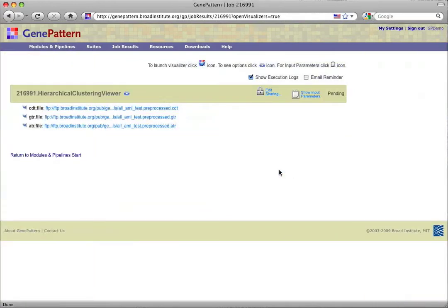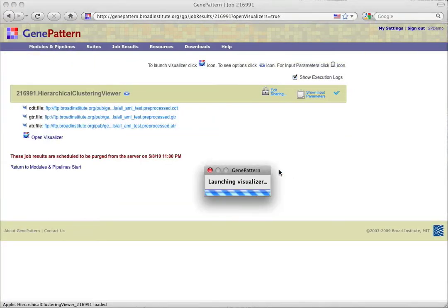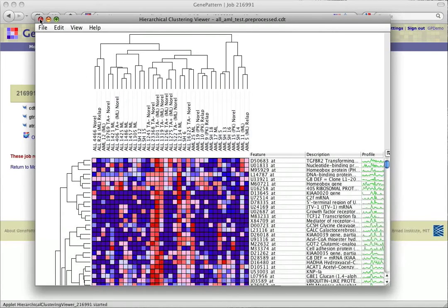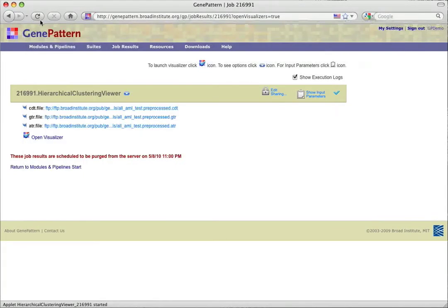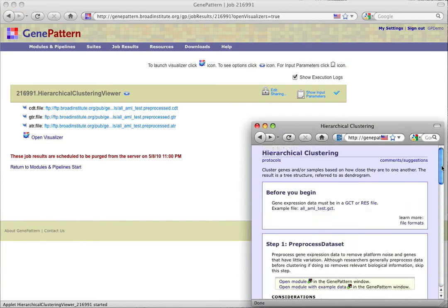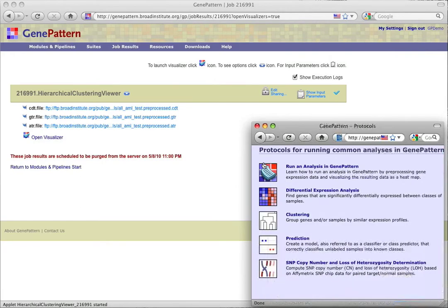After interacting with the viewer, we could then choose to save the image as suggested in the protocol. Now we could go back and try this same protocol with our own data, or by clicking on protocols in the very upper left corner of the window, we could select another kind of analysis workflow to learn about.